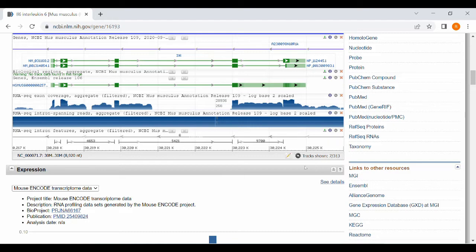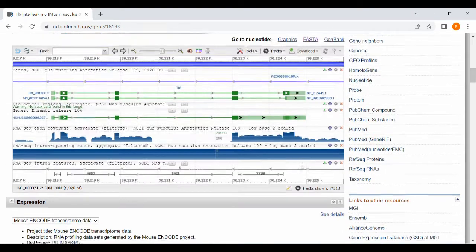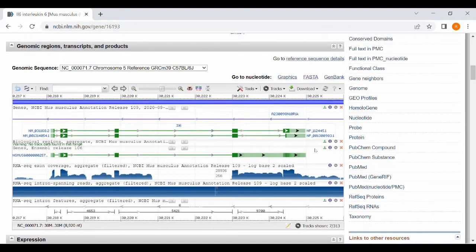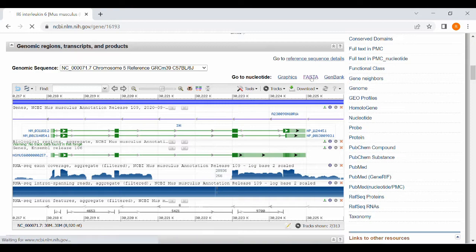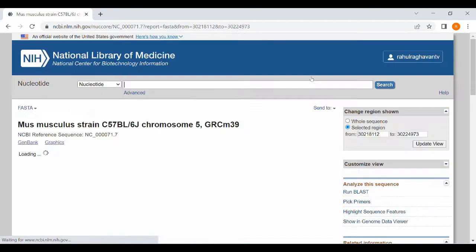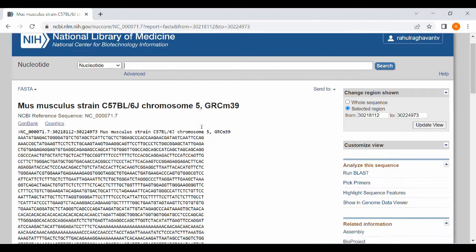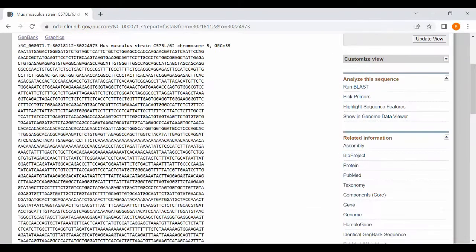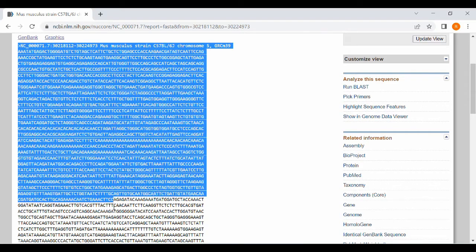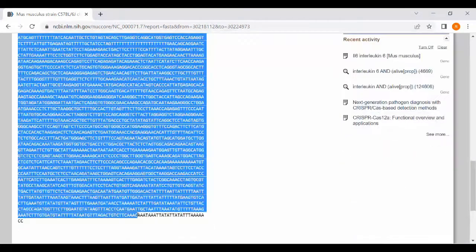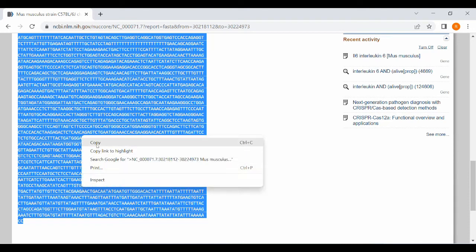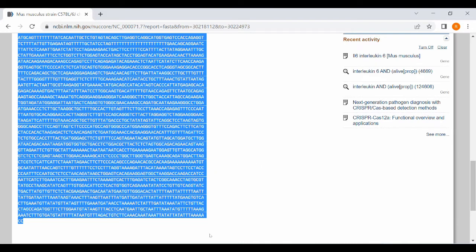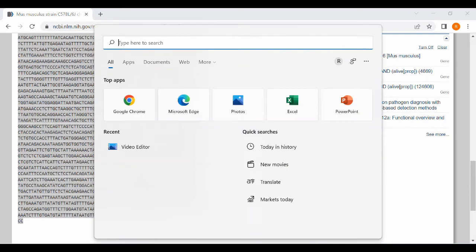And for nucleotide sequence, click onto the FASTA format given on the right hand side. Click onto the FASTA format and you will have the nucleotide sequence. This sequence is directly from the mouse chromosome, so you will have both exons and introns.